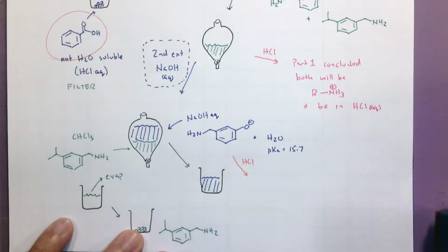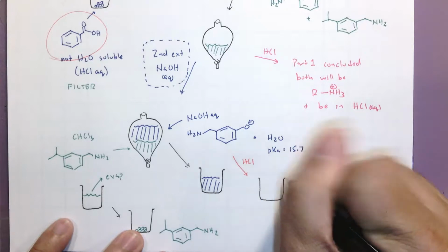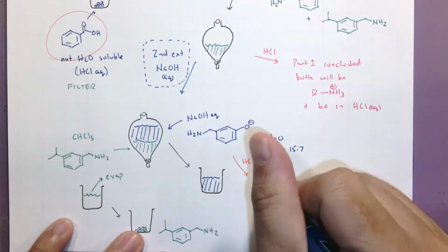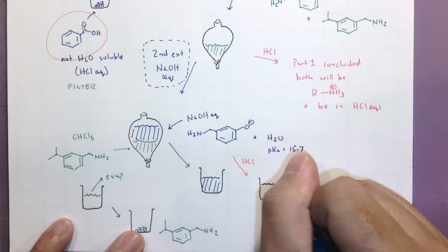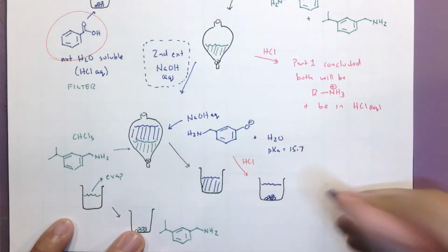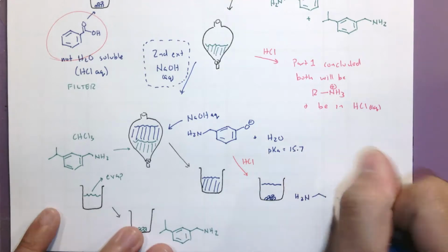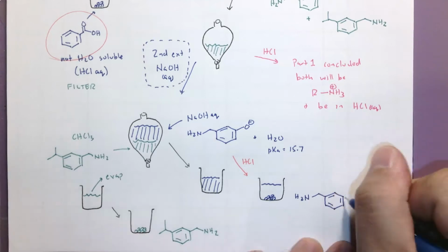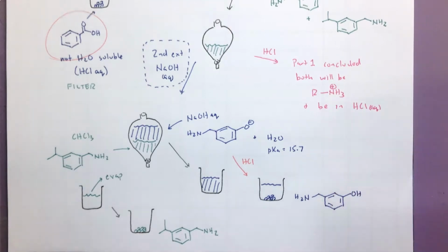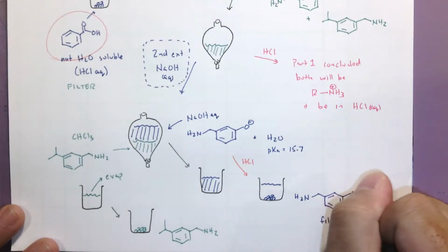When you add HCl, what you'll notice in your beaker is that your water will maybe clarify, and then you'll get some precipitate. Because again, what is the idea? Uncharged molecules are not soluble in water. And you go to filter again. Filter this solution.